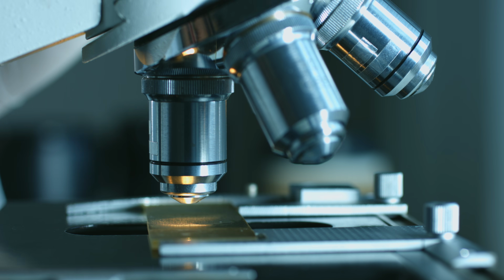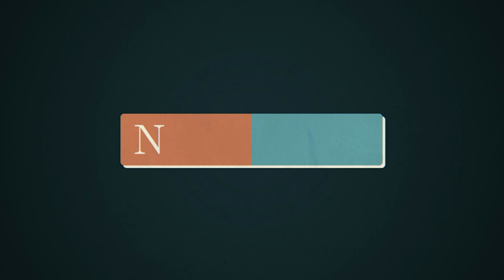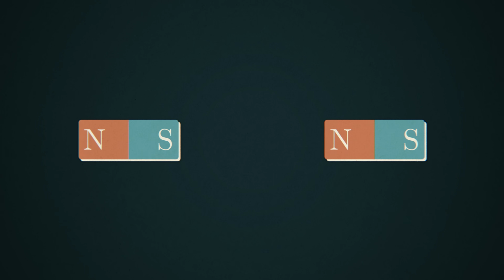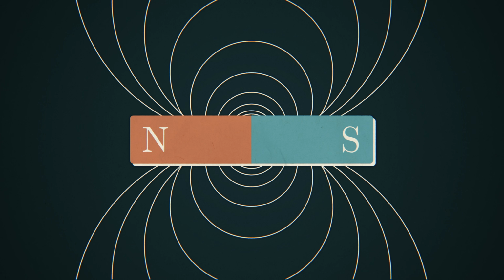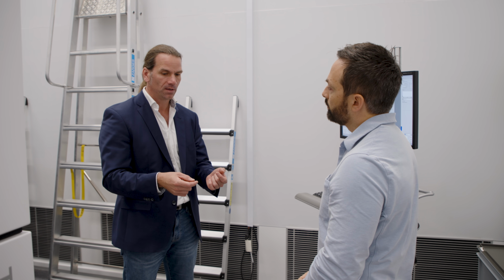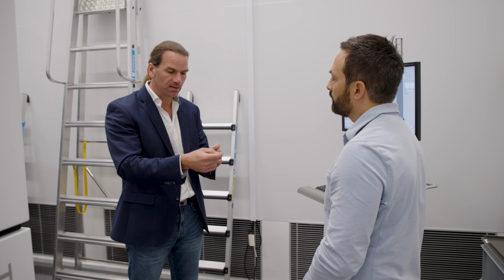So you might imagine that the TEM simply needs its own version of a diverging spherical lens to magnify further. But with magnets, this is physically impossible. Every magnet has two poles, a north and a south. It's impossible to just have one. Even if you split a magnet down the middle, it creates two smaller magnets, both with a north and a south. And all magnetic field lines have to start at one pole and end at the other, forming a closed loop. It's a direct result of the second Maxwell equation, because the field that you create has field lines that start and end at the same magnet.